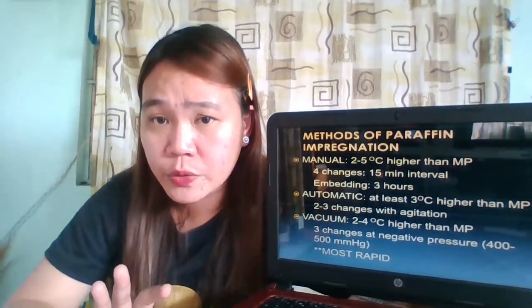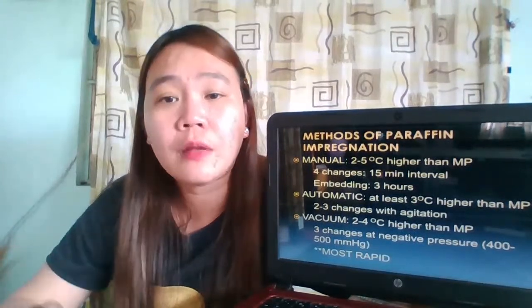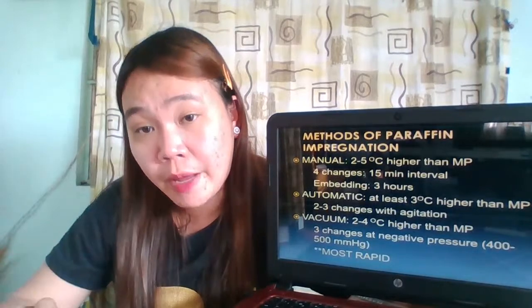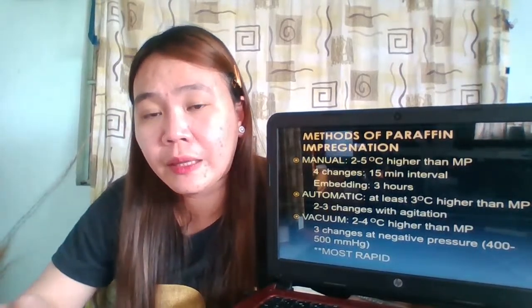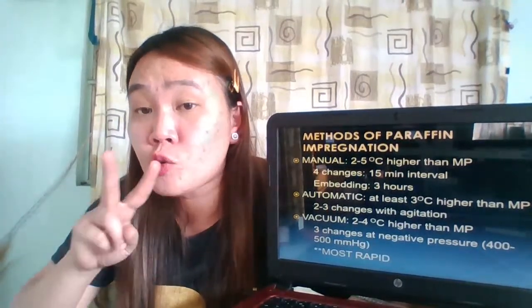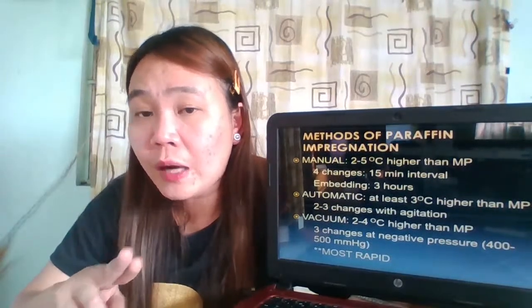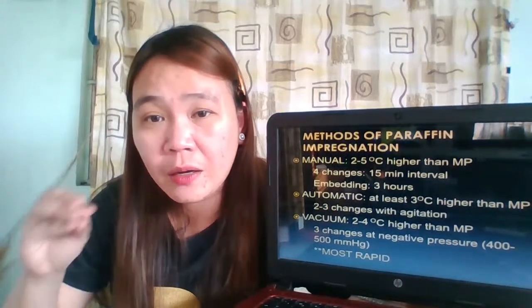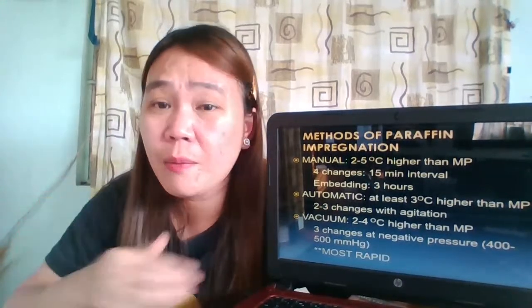Do not be confused, because when we were discussing the introductory part of paraffin, it said the minimum requirement as for the number of changes is 2. We were talking about paraffin impregnation in general, not specifying the method.